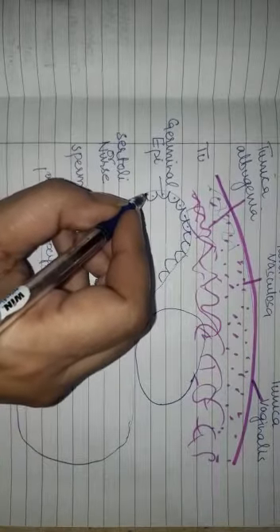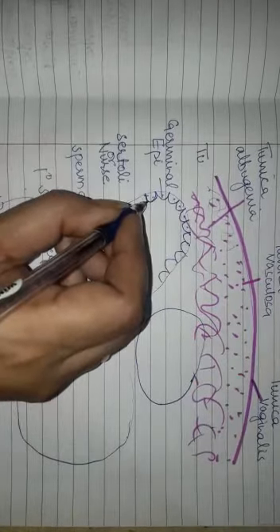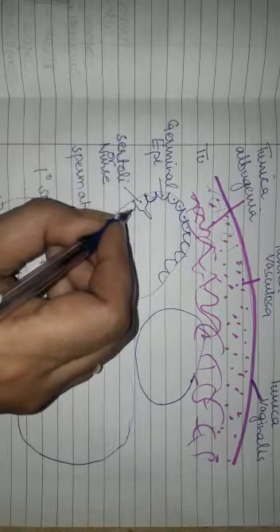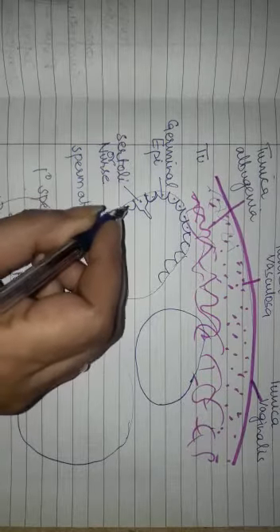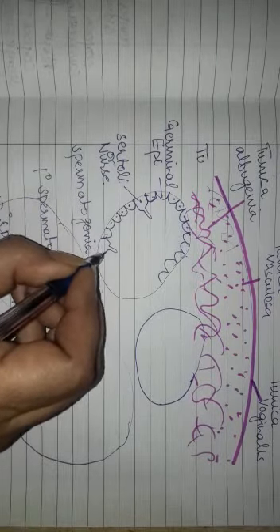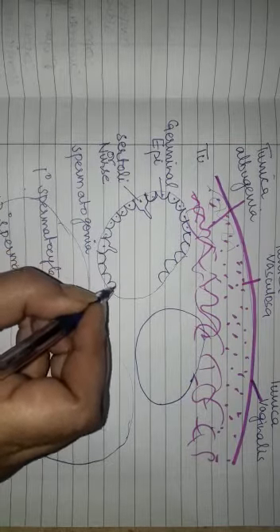Most of the cells are smaller, and few cells are larger in size than the others, and these are called the nurse cells or the Sertoli cells. So seminiferous tubules are lined by a layer of germinal epithelium.